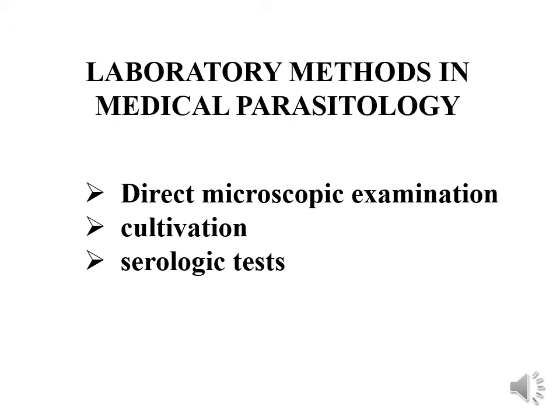So there are normal or very common laboratory techniques which are followed in a diagnostic laboratory, and for those, usually the most important equipment is the microscope, because when you see the diagnostic stage of a parasite, whether this stage is a cyst, trophozoite, an ova, which is an egg, or a larva, or the whole organism, then this is a precise identification.